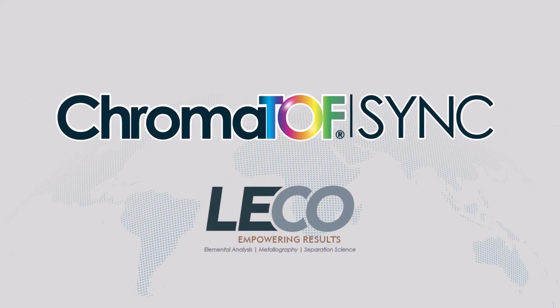LECO's ChromaTOF Sync 2D offers advanced data processing options for Pegasus BT datasets. The software simplifies non-targeted characterization and comparisons by combining information for multiple GC×GC samples with full peak finding and deconvolution.